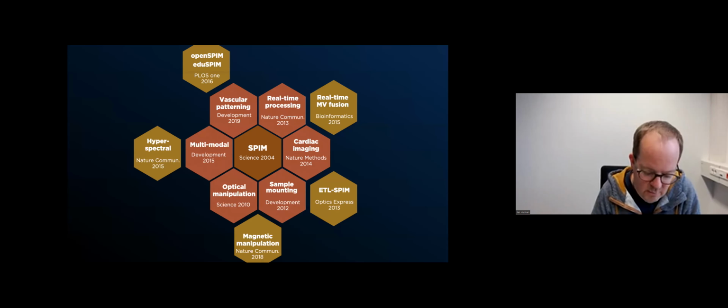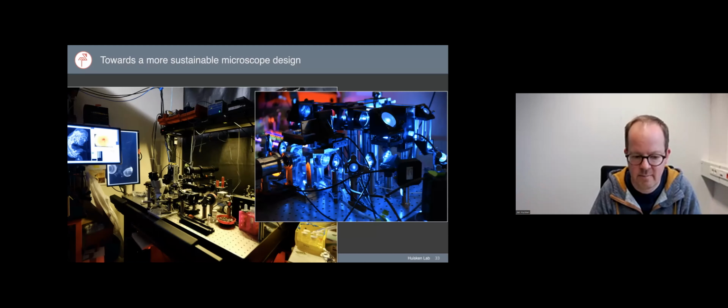And when I moved from Dresden to Madison, we realized that we've gone off in all sorts of different directions, but still using light sheet microscopy as the main tool of choice. But still, every little experiment was really an experiment on its own, right? And that meant that each and every publication was essentially done on a new device that was built by a PhD student or a postdoc, and it was by no means reproducible, right?